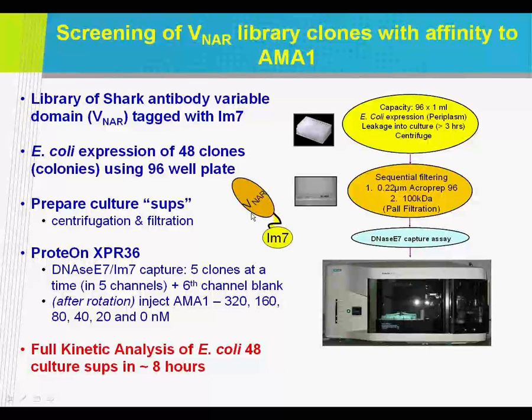And I eventually was able to group these into, I guess, 7 different groups based on their kinetic profiles. The way we did that was using this kinetic distribution plot. And all you're really doing is you take your determined dissociation rate constant, kd, you take an association rate, ka, and plot them against each other.